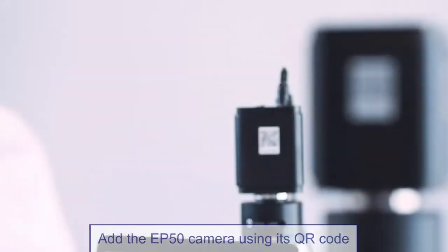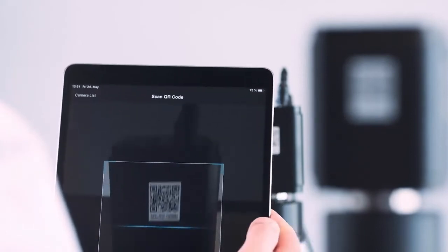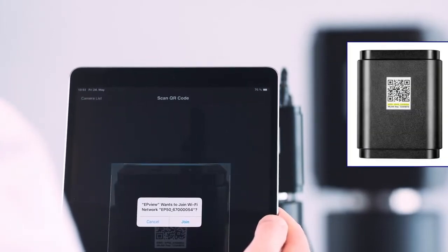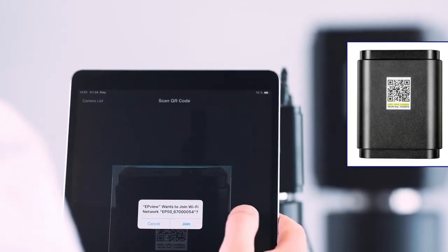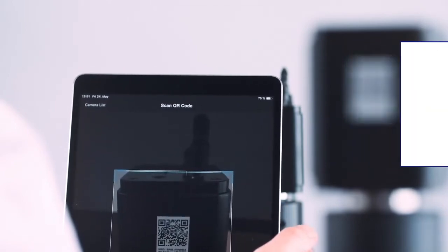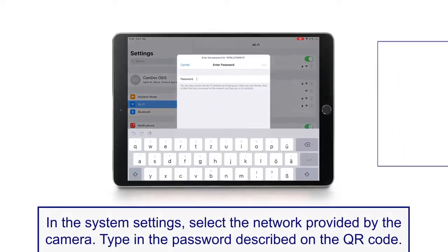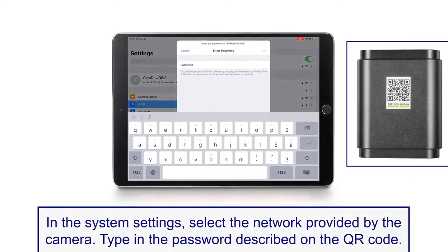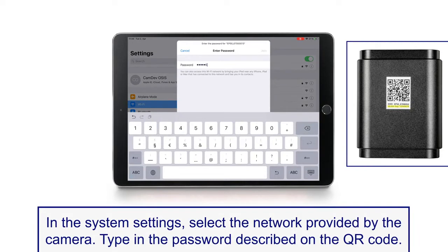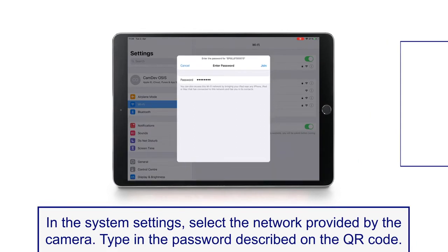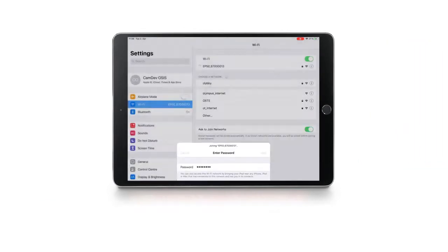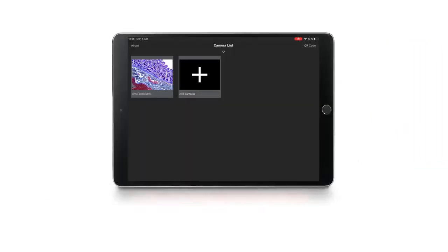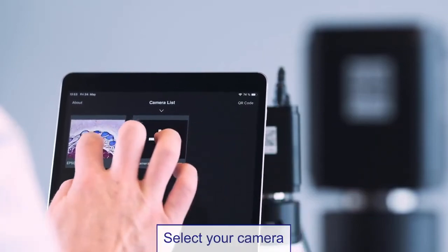Connect to your EP50 camera by scanning the QR code with your mobile device using the QR scanner in the EP View app, or manually by selecting the camera's wireless network. Your camera should now appear in the camera list — select it by clicking or tapping the thumbnail.